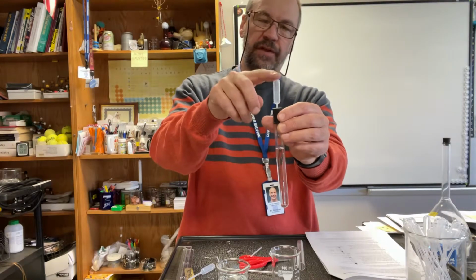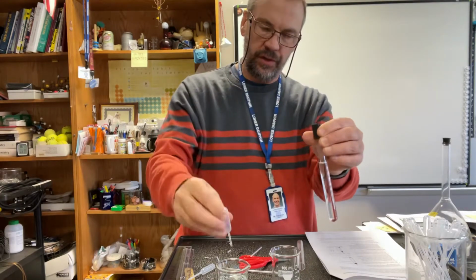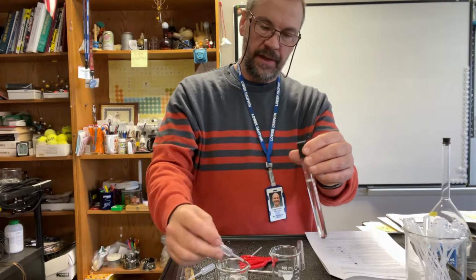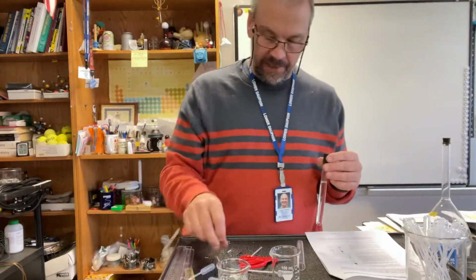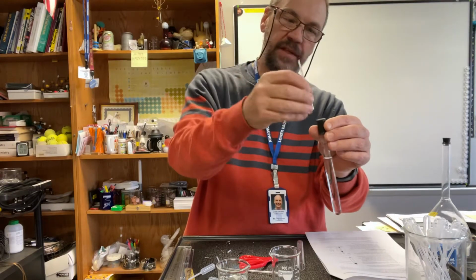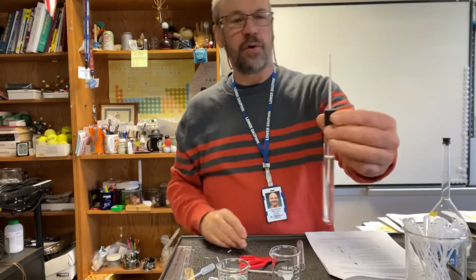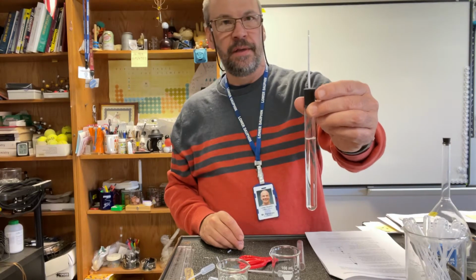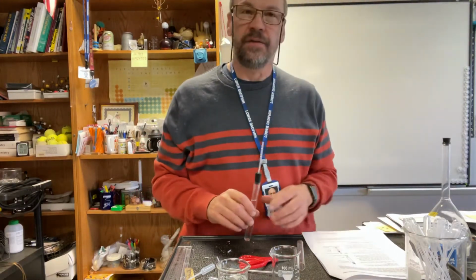You actually have to fill up the gas collection with water. So the way you can do that is put it in the water, draw the water up into it, and then you can insert. All right, in the second part then, when you need to use a straw, all you're going to do is take that piece that you cut off, that stem, and that's going to be inserted into the hole of the stopper. So you'll use that as your straw. Mr. Fox will go over the rest of the details, but that'll get you started with that.